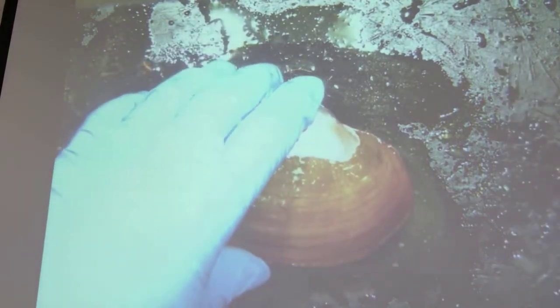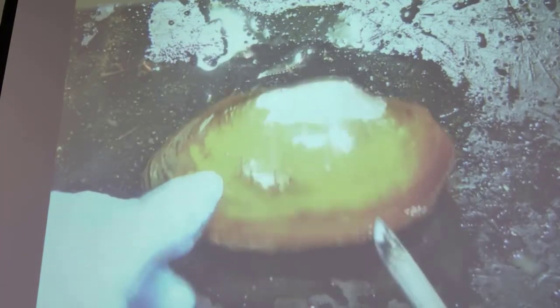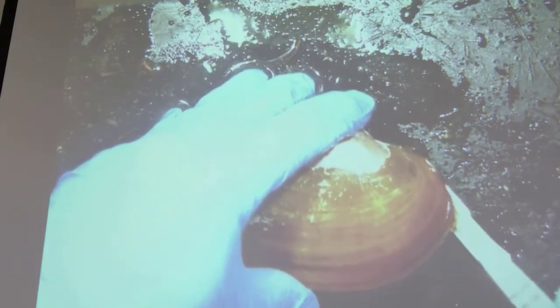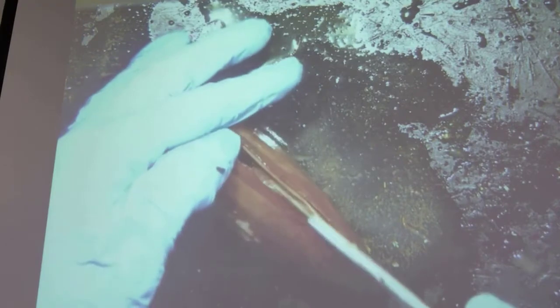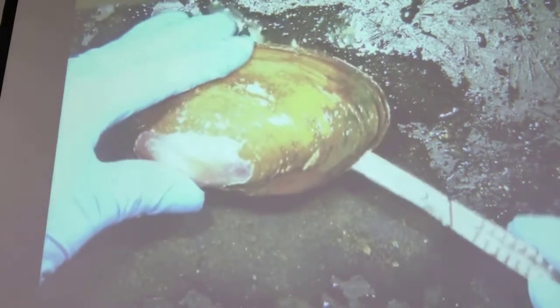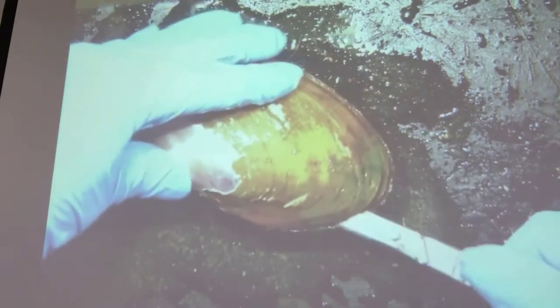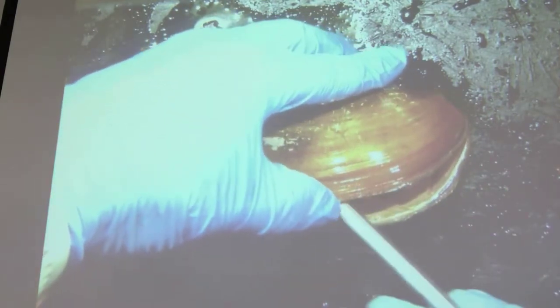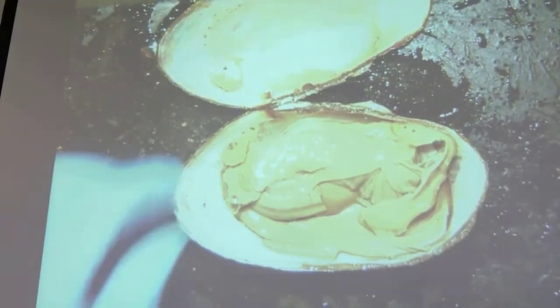We're going to cut through the anterior and posterior adductor muscles, which are holding the valves together. And if we're able to carefully open the valve and separate the mantle from the shell, we may be able to see the siphons.